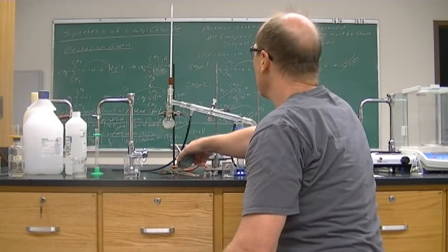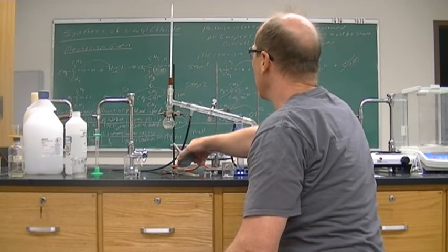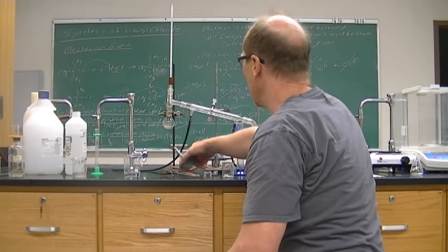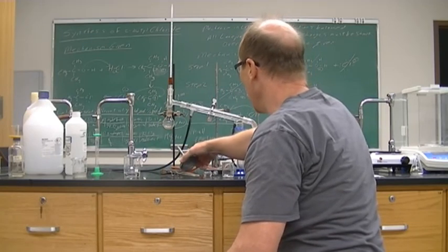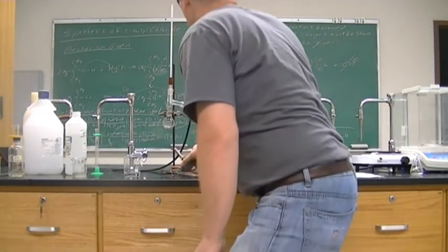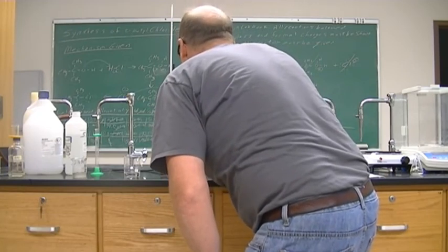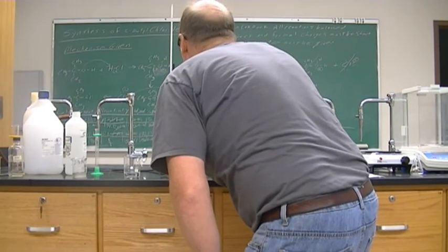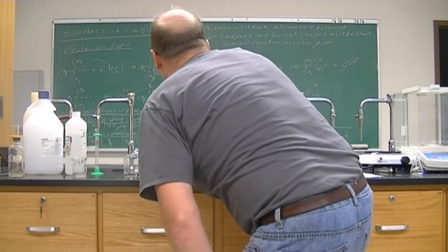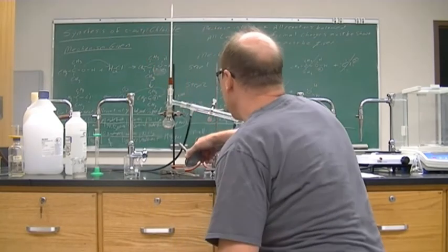I didn't put any boiling chips in there because the liquid is such a small amount that this is really just going to get me the boiling point of my t-butyl chloride. So it is boiling. I'm looking at the solvent front. All right, now it's on the thermometer, and I'm getting a boiling point. Right now it's at 50.0. So the boiling point, 50.0.